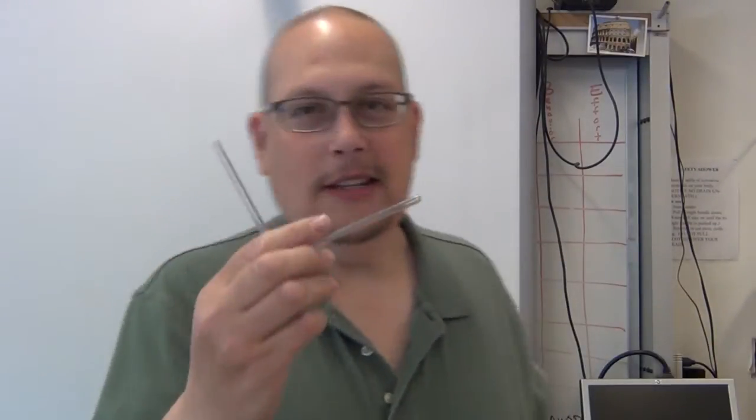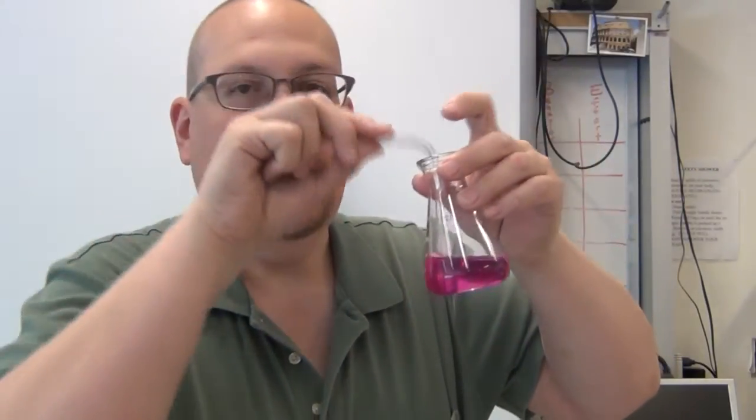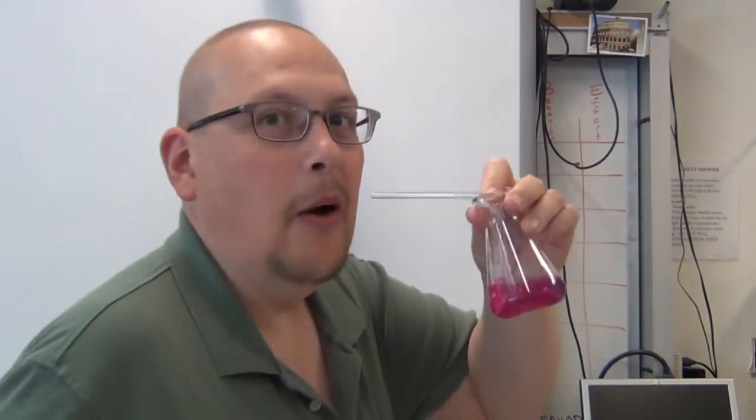And now, as promised, I'm going to prove to you that I have acid breath. Here's how. I'm going to take this straw. It's actually a piece of glass tubing. And I'm going to blow through this straw into this phenolphthalein like so. Are you ready? Okay, here we go.